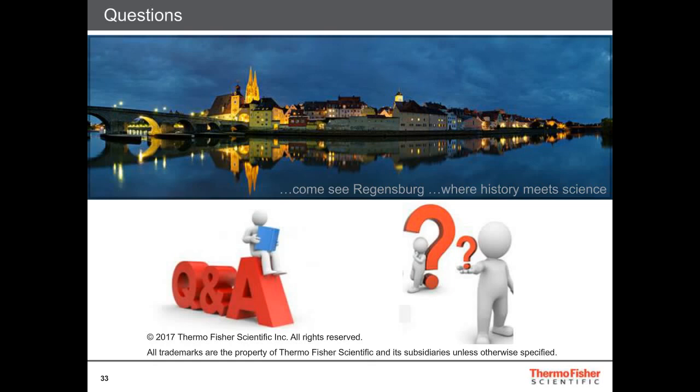Of course, capacities are getting a little bit lower for those large-scale projects, but in the 50-liter range, we can do 3 to 4 antibody projects per month, I would say.